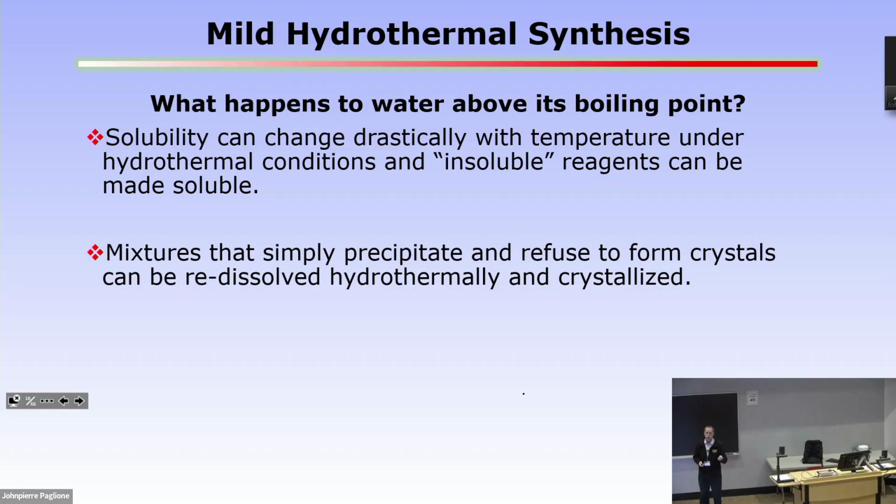That doesn't mean everything is going to dissolve, but many things that otherwise don't will. And sometimes you have to go to higher temperatures or pressures to get things to dissolve. But it's a nice approach to grow crystals of things that either you can't get into solution at all, the reagents that is, or where the products precipitate so quickly that you don't get a crystal out of it.